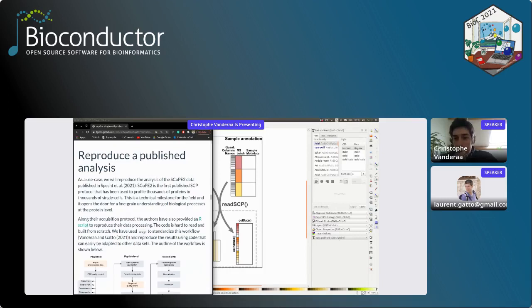So Max, can I ask you, did you try to run this through the RStudio provided by Orchestra, or did you run it on your local machine? Because definitely this error is because you are using an older version of RStudio. Okay, I mean your RStudio or the RStudio of Orchestra? Because the thing is, this is an error, meaning that the wrong package version is used. Okay, your log.